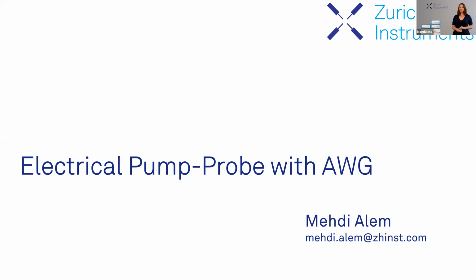All right, let's continue our afternoon session with the second part, the tutorial. Our application scientist, Mehdi Alem, will show you how to set up an electrical pump probe experiment using an arbitrary waveform generator and a lock-in amplifier integrated into a single instrument. Let me quickly remind you about the Q&A session that we're gonna hold after the tutorial. Please submit your questions to the Ask a Question tab in the bottom of your Zoom window. Now, over to Mehdi, it's your turn.